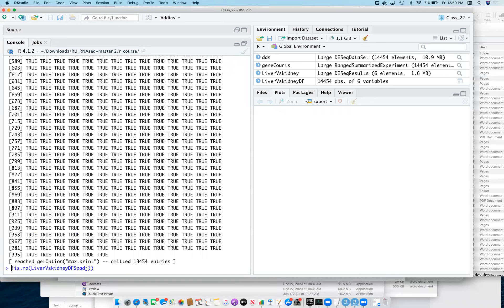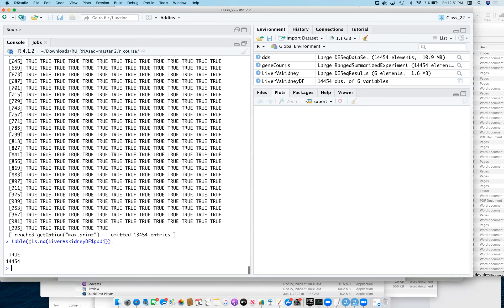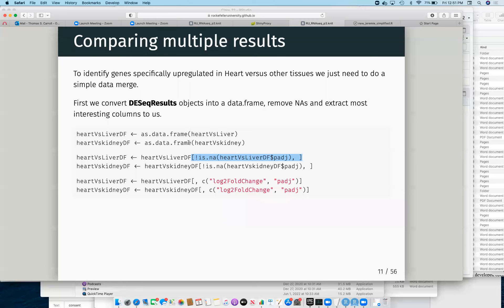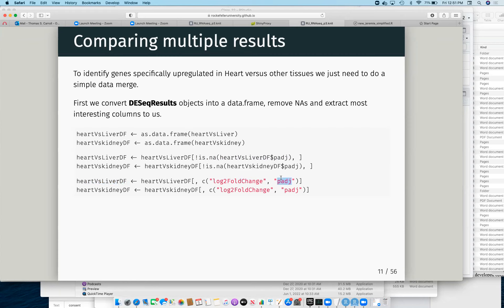It seems like I might have already filtered this before class. If not, you can do this.na — which would just filter out any columns where the p-adjusted was not NA — it's going to keep those. That's how we can remove the NA p-adjusted values. And then finally for this one, I'm just going to subset down to log fold change and p-adjusted. We already have the row names which contain the Entrez IDs. Now I have two data frames which contain just log fold change, p-adjusted value, and row names as the actual gene IDs.